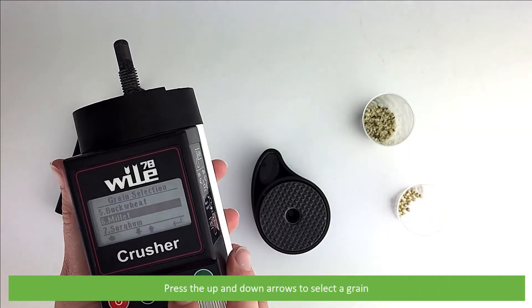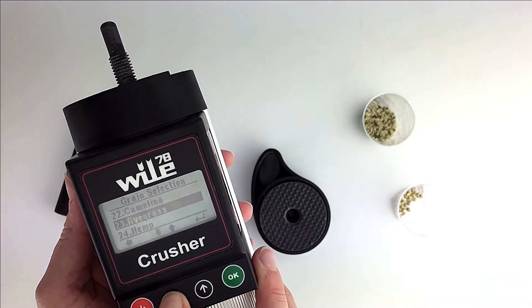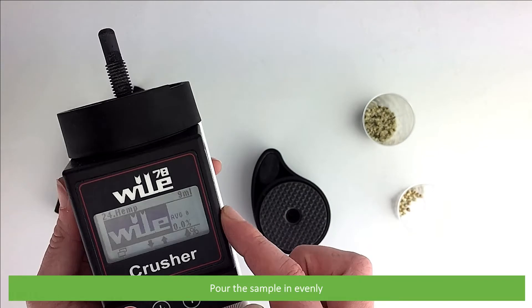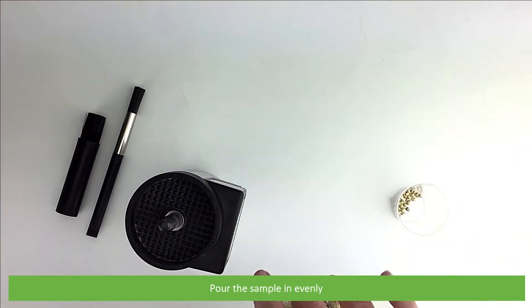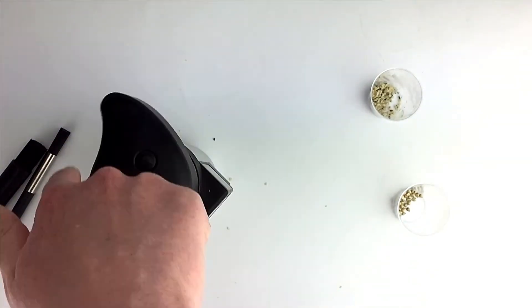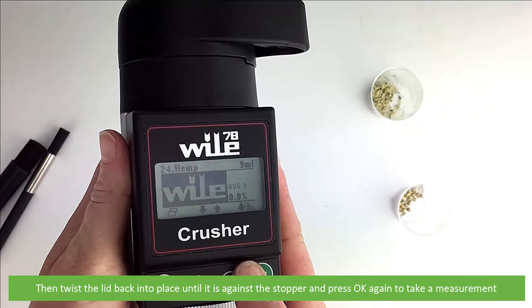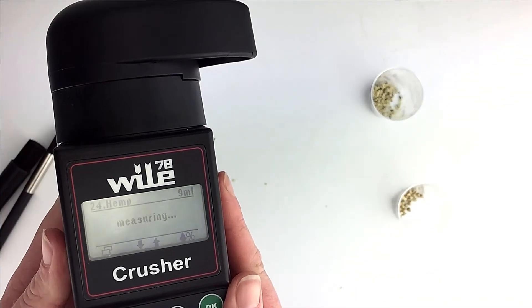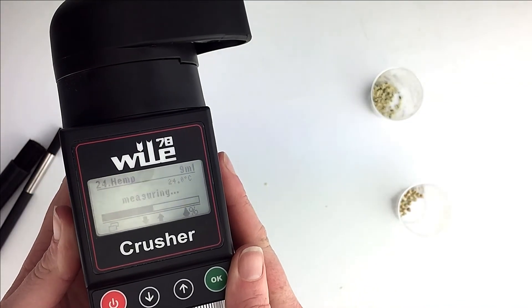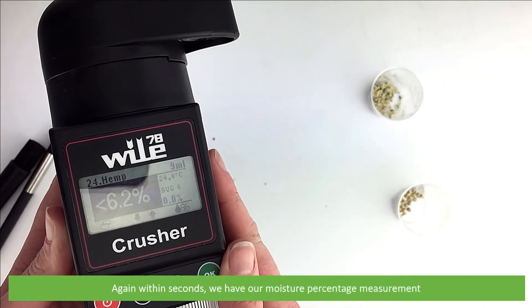Press the up and down arrows to select a grain and press OK to confirm. Pour the sample in evenly, then twist the lid back into place until it is against the stopper and press OK to take a measurement. Again, within seconds, we have our moisture percentage measurement.